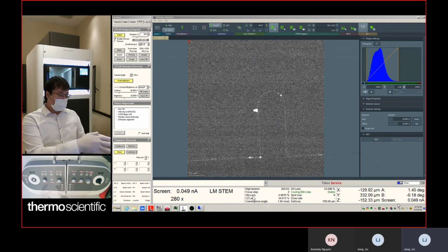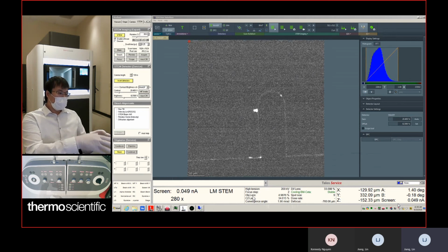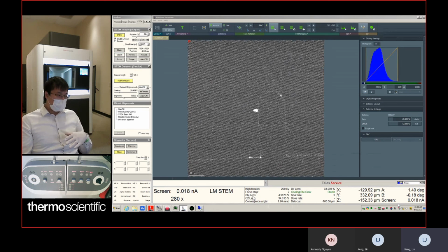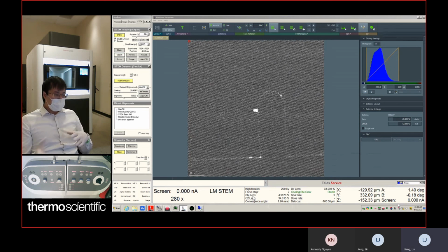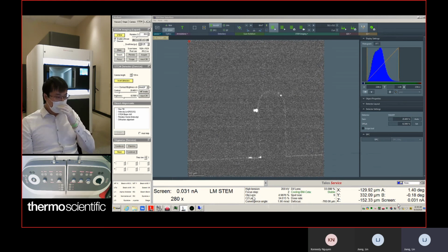Low mag, we can go to small mag in TEM to keep the objective lens on. We find the sample and then switch back to the normal STEM mode to do imaging. In that case, you still keep your constant power lens on, and you don't need to do so much tuning.